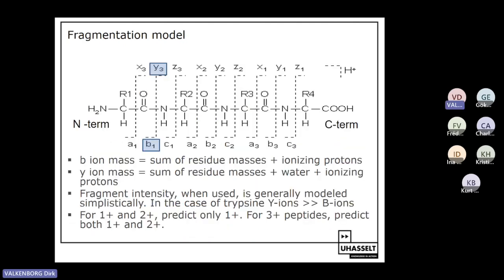Good. So once we have now selected our peptides, or candidate peptides that we need to map on our spectrum, that's a little bit tricky because a peptide is just a concatenation of letters, amino acid letters. So it lives in the text world. And our tandem MS spectrum is just a bunch of peaks. It's a spectrum. It lives in the spectrum world. So how will we now try to figure out whether a piece of text will match a spectrum?